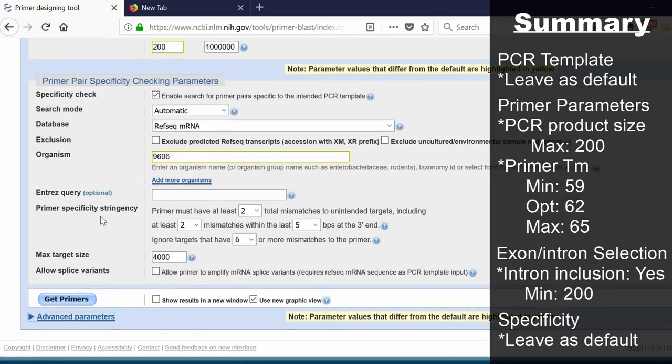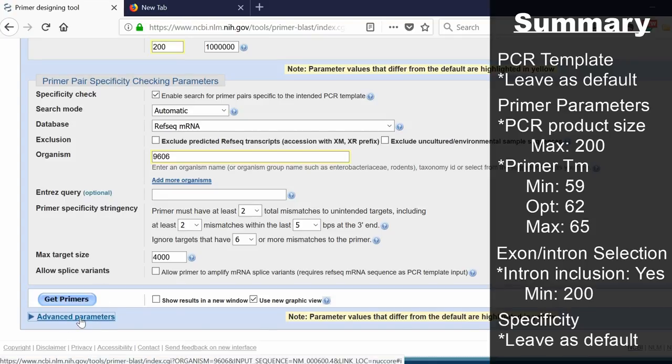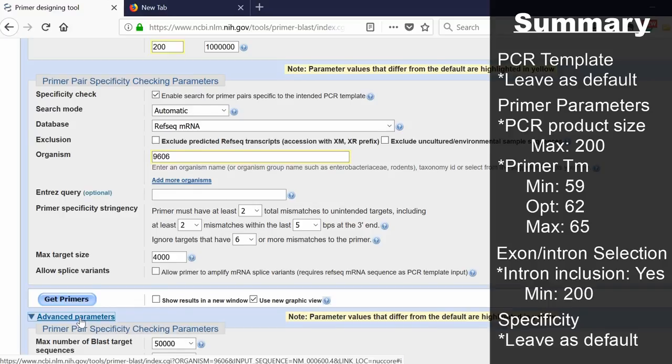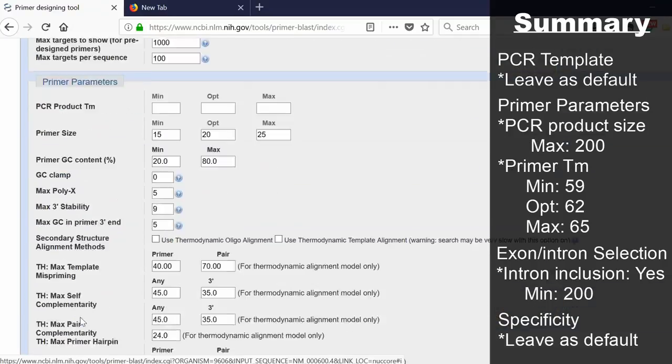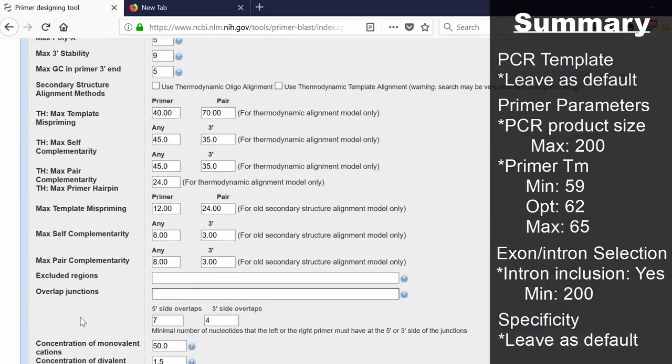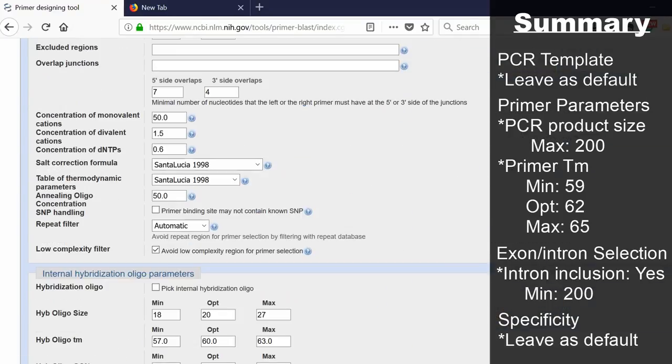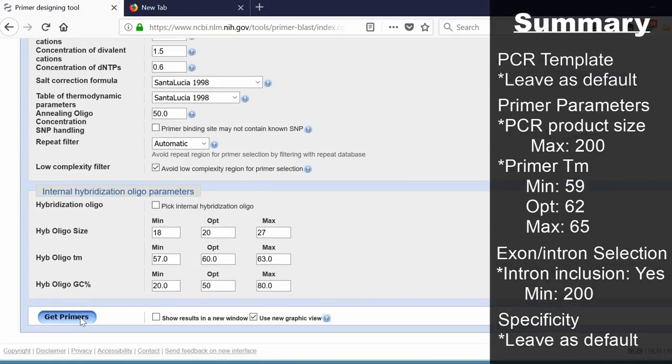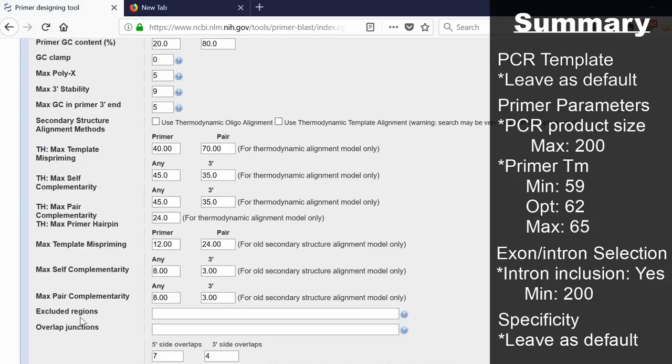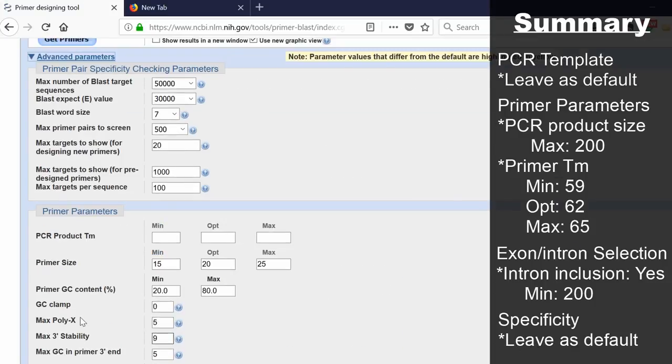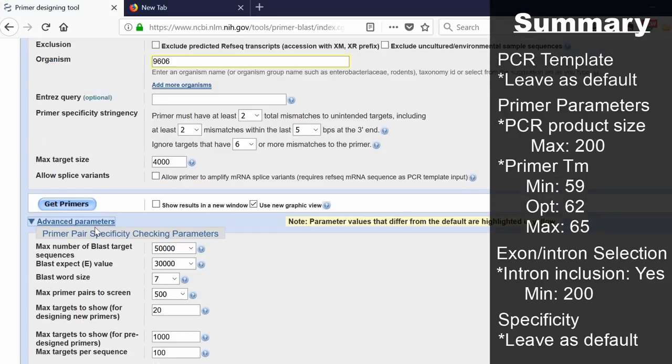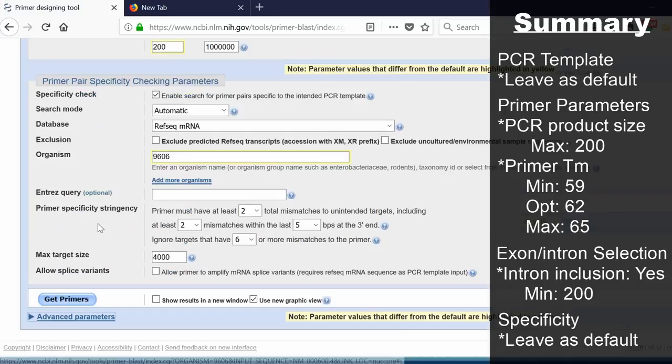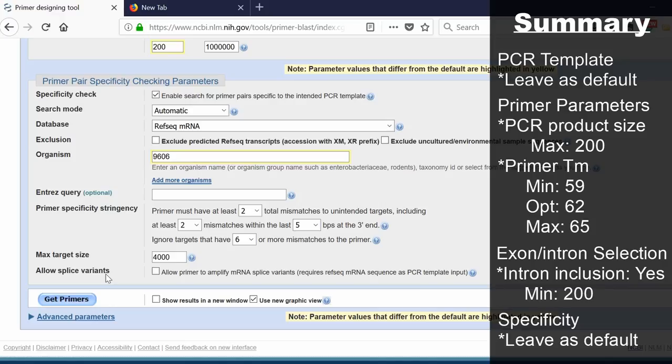For those of you that want a bit more flexibility in your primer design, there is also an option at the bottom that says advanced parameters. You'll get a lot of detailed parameters that you can change here, but I would advise leaving these as default to start off with. To run Primer Blast, click on the button that says get primers.